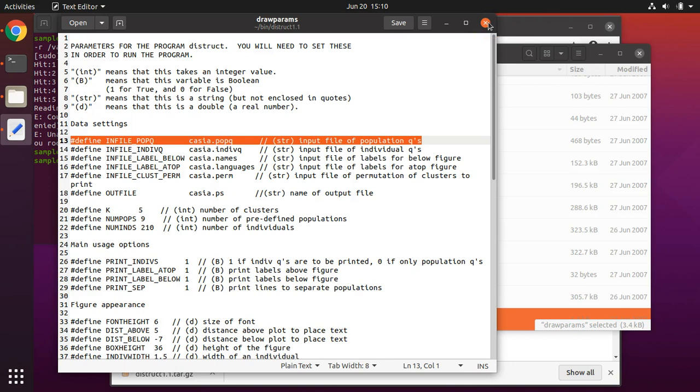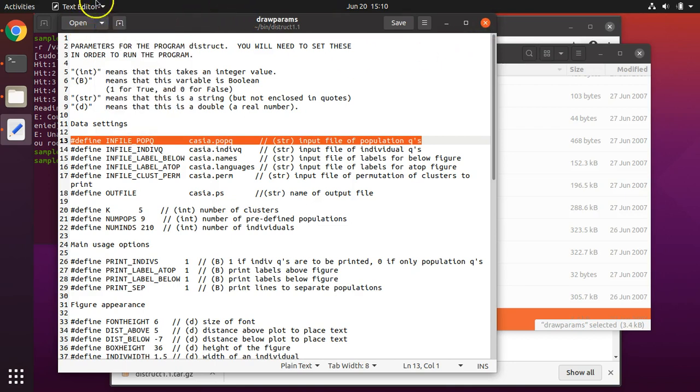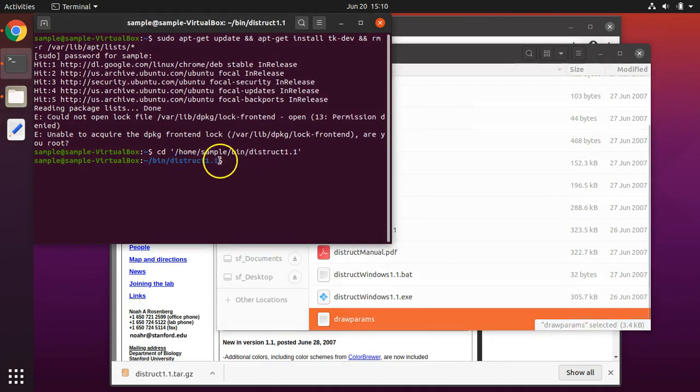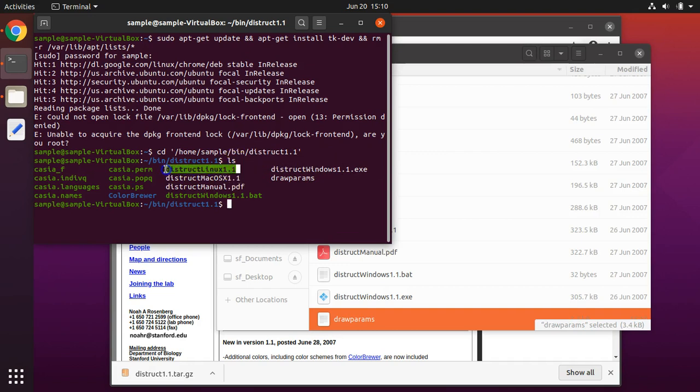When finished, you can click save and then you can close draw params. To run the program, let's see what's in our DISTRUCT folder. This is the file we need to run.